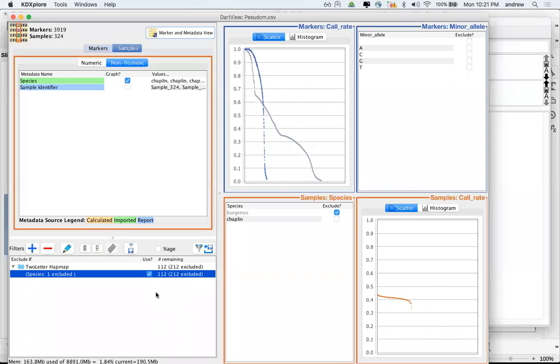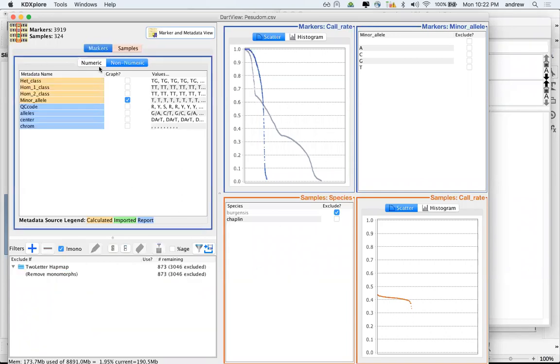Typically, a lot of workstations work in the perspective of what we might want to include, but the filters in this context are all to do with what we choose to exclude. So at any point, I can choose to export this data set and create a new subset.